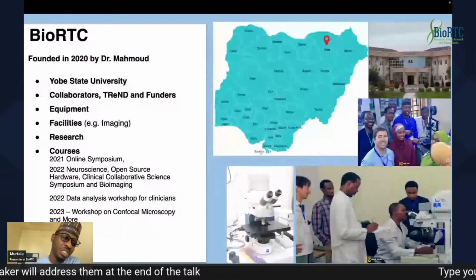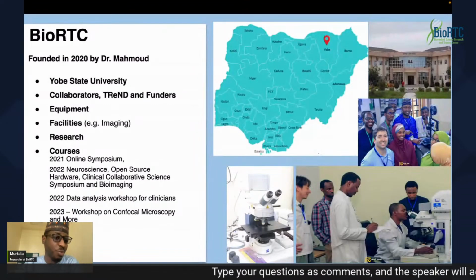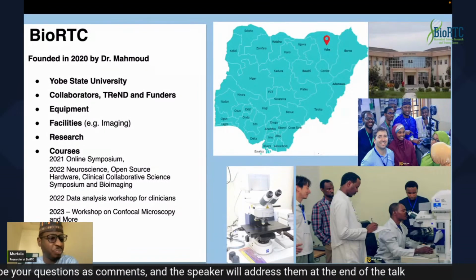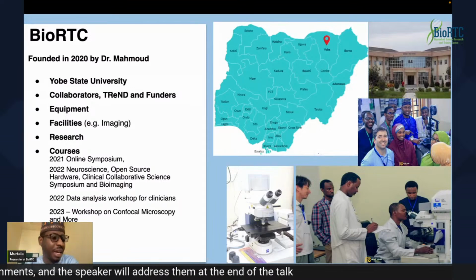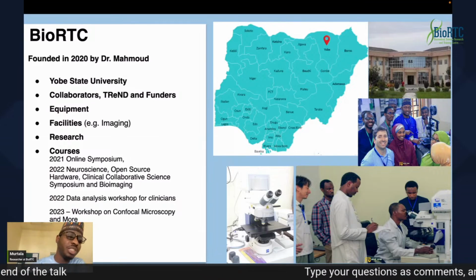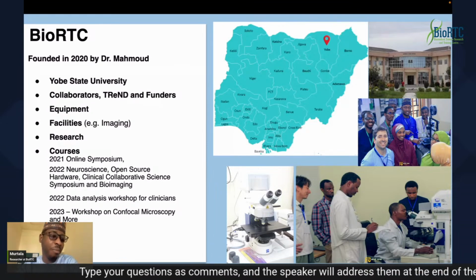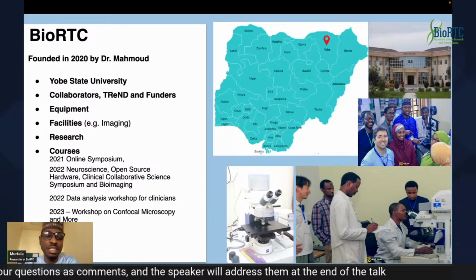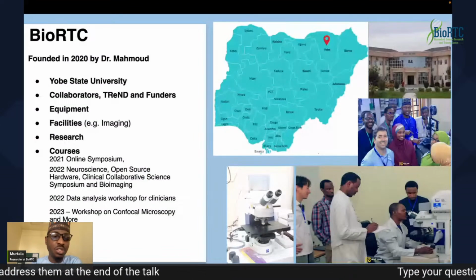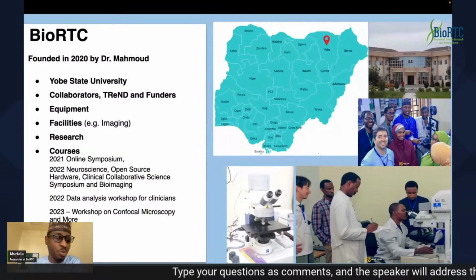So this equipment is received, and the Yobe State government, through Yobe State University, is responsible for accommodating it and ensuring that the equipment is installed and in good use. We have the equipment that are there, which I'm going to show you in the next part of my presentation. There are a lot of facilities in BioRTC, but the one we are most known for is the imaging facility. We currently have the only confocal microscope in Nigeria, and that is something I'm going to talk about later. The center will also be responsible for conducting research.